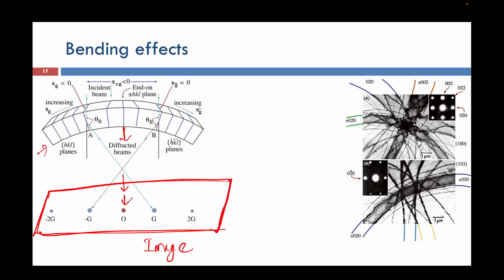let's say, my direct beam which is not interacting or not at a Bragg's orientation to all these planes. This is a plane, this is a plane, this is a plane. So now due to bending, what has happened, my Bragg's planes are also a little bit inclined from their earlier perfect Bragg's condition. Let's say this is the perfect Bragg condition. Now all these Bragg's planes are inclined. That means they are not situated in a position that they can perfectly diffract.